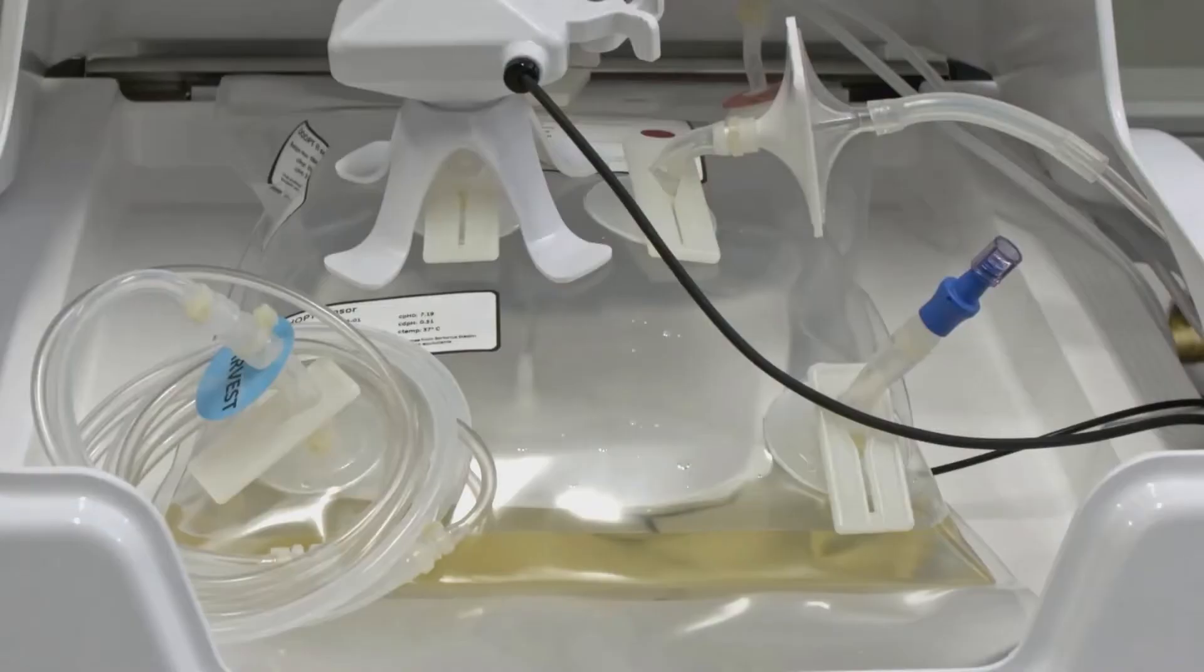Once the cell bag has filled with the set point value of media, you can go back into Unicorn and turn on the rocking and temperature control so that the media will warm up in the cell bag and you will be ready to add your cells into the bag.